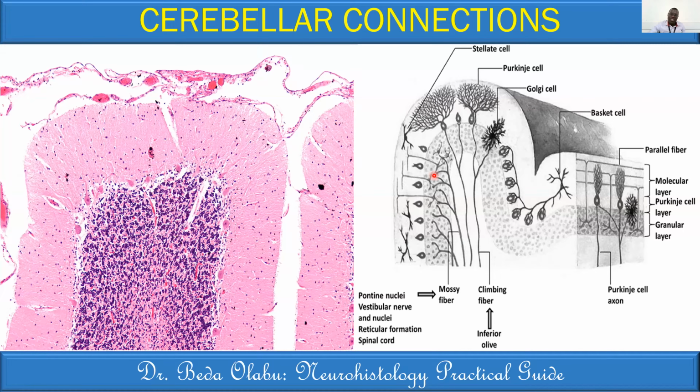The mossy fibers relay within the granular layer. The conglomerate of the relay is what we call the glomerulus, or the mossy fiber rosette. From that relay, there are some neurons that now take their axons all the way to the molecular layer, and you can see that they divide so that now they can synapse with the dendrites of Purkinje neurons, which are within the molecular layer.